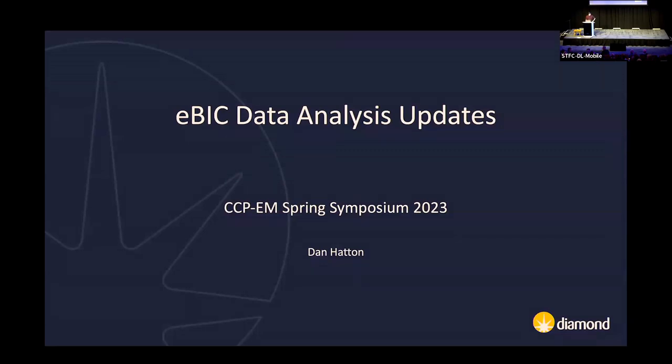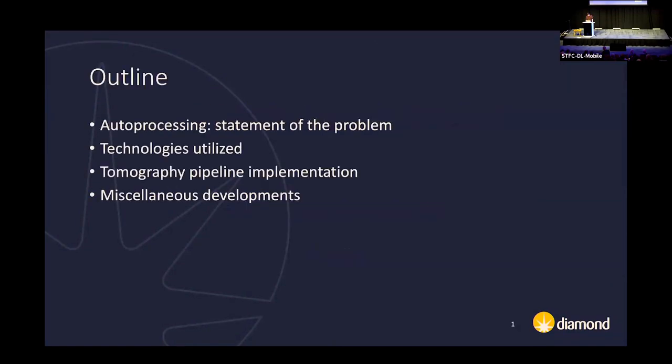I'm part of Diamond's data analysis group, where I'm the team lead for cryo-EM data analysis. As a team, we try and deal with all of eBIC's data analysis requirements, from central installations of processing software to developing and deploying automated pipelines for users. So that's what I'm going to talk about for the most part.